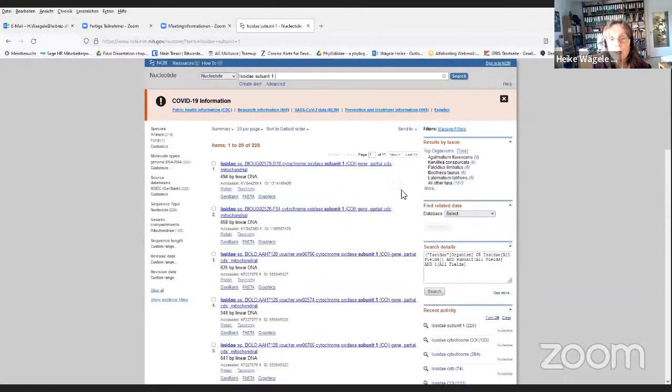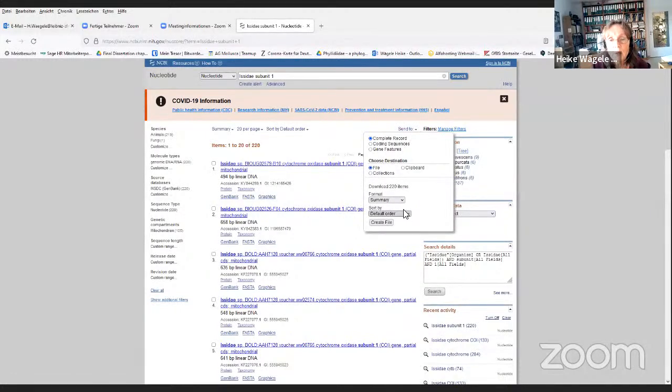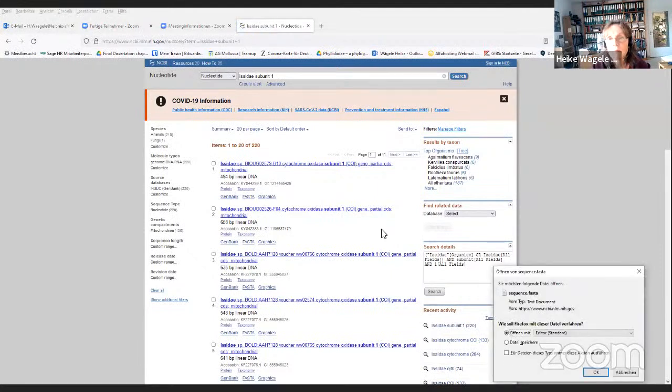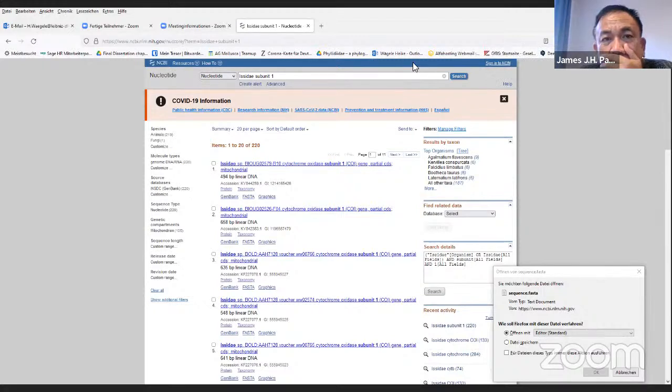But what I would always do now is, when we don't click on specific ones, when we just keep it like this, what you do next is Send to. We have complete record. We use file. We create FASTA, and we create the file. Where is it now? Oh, it did not work. I don't know why. Ah, no, sorry. It's here.